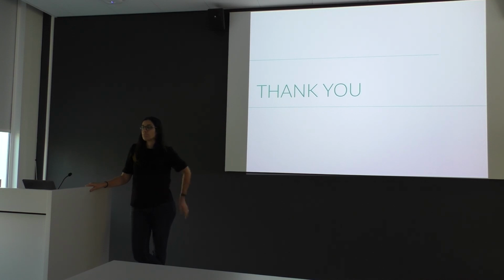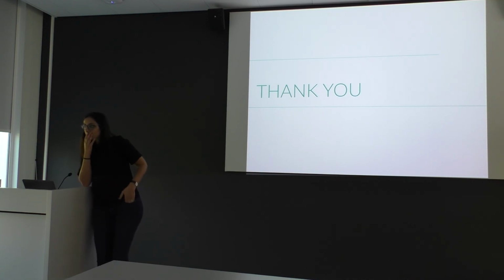Also got a question with the workflow. It's all very nicely set up, very perfect. How sensitive is it to a service engineer coming from FEI and getting back to that optimal setting? So every other day is the setting exactly the same, because there might be more than one user? Where it's very, very stable. It's back to the original setting.